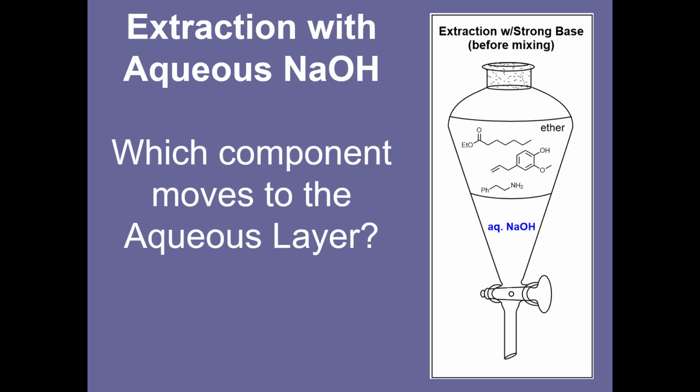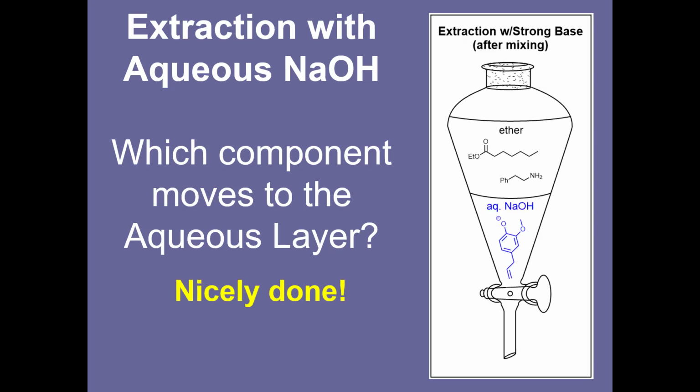If you guessed that the phenol would be extracted to the aqueous layer, nicely done. The sodium hydroxide won't react with the ester or the amine, so those components stay dissolved in the organic layer. The phenol, however, will be deprotonated by the hydroxide, and the resulting phenoxide salt would move to the aqueous layer.